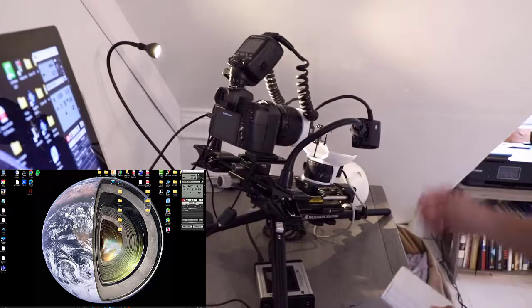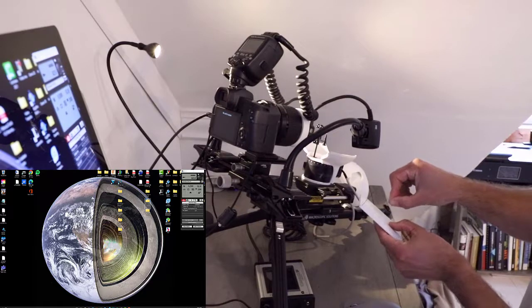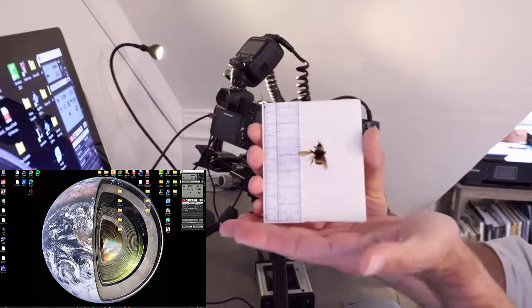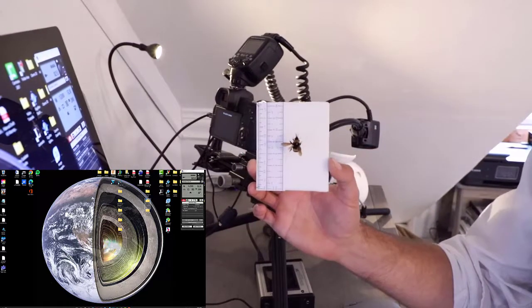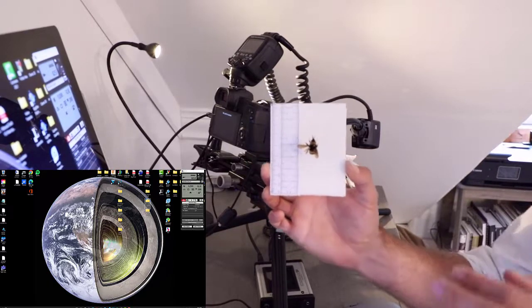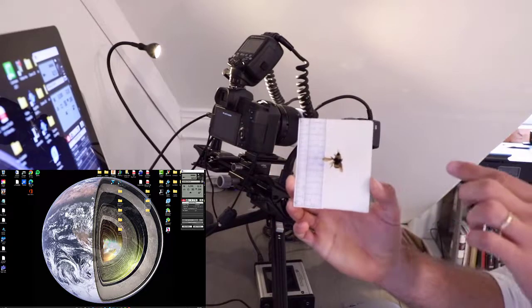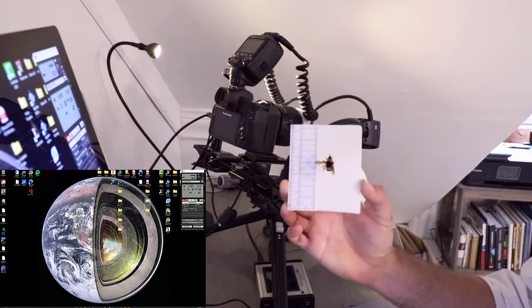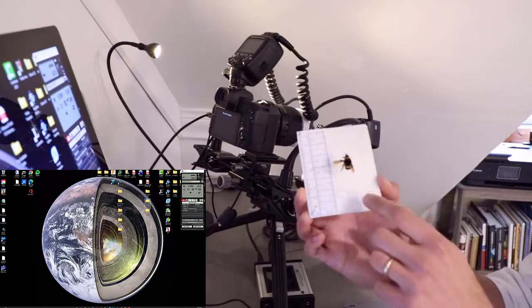So, what I have here is a bumblebee. What I'll do is I'll post this here and share it with you, just so you have an indication of scale. Okay, so the entire specimen is about 2 centimeters, 2.5 centimeters in length. It's not the darkest specimen we have, but bumblebees typically are quite dark when you're doing a headshot or you're trying to photograph legs or even the wings sometimes. So we're going to work with this specimen, also being that it's a little bit larger.